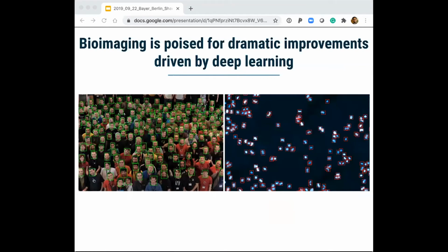We're also working on the next generation of computational imaging techniques, in specific leveraging the rapid developments that have been made in computer vision and deep learning. Computer vision, as Anna will talk about probably later today, is a field that's focused on analyzing natural images like faces and scenes. And by about 2012, modern artificial neural networks had beaten the state of the art on nearly every major computer vision problem. For example, the problem of finding faces in a picture can be done very easily now using neural networks.